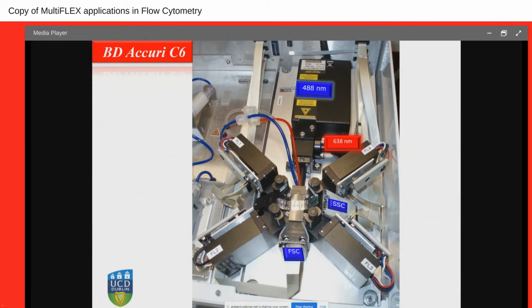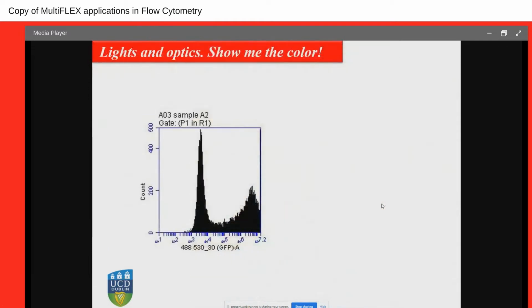And the other thing that was weird is to see that they have only one filter in front of the photomultipliers, where usually we are looking at multiple filters aligned one with the other. That was kind of different as well. And as I said, this logarithmic scale was great because practically everything was fitting. Nevertheless, not all the samples were properly set up or fitted into that logarithmic scale.